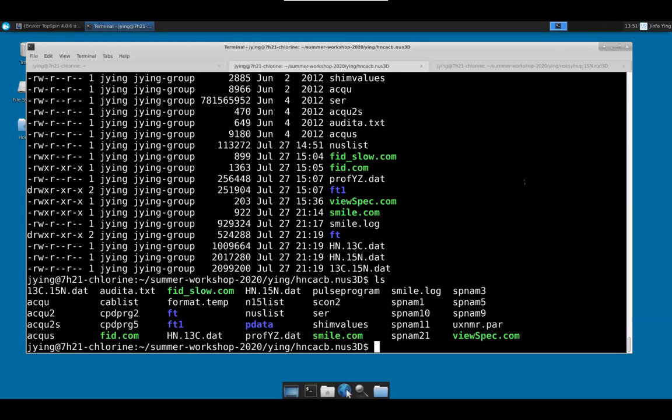Hey, Jin. Yes. Okay. So yeah, for most of the bioNMR sequences, if you end up with an echo anyway, the dead time DE shouldn't matter, is it not? That's true. That should be very true. But for some reason, the dead time still matters. Okay. Yeah. For some reason, I don't understand it. You are right. If we have an echo, we have a few milliseconds. They shouldn't care. Yeah, really. Yeah, between 6 to 20. For cryoprobes, for some reason, at the moment when the receiver is turned on, something happens.